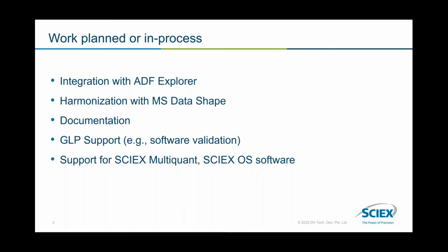We'll produce some documentation. We will create those artifacts necessary to validate the software for GLP use. And we will, at some point, support the SCIEX multi-quant processing software, as well as our next generation instrument control and processing software, SCIEX OS.